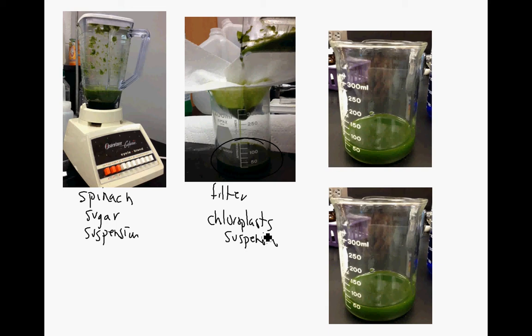We're going to have two samples of this. One will be unboiled, and then I will boil another sample. So we'll have unboiled chloroplasts and then boiled chloroplasts. Even though they look the same, they're going to be different.